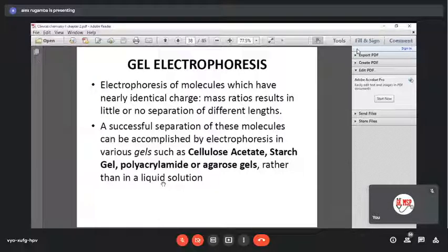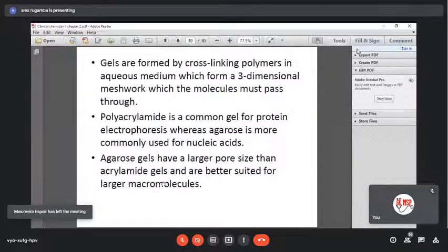If you are loading, for example, in PCR, running a gel for PCR, we have just run DNA and we put electricity and we know that at a certain size, the band will appear there. Then we say, okay, this sample has this DNA inside, okay?